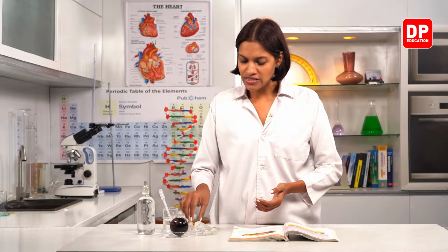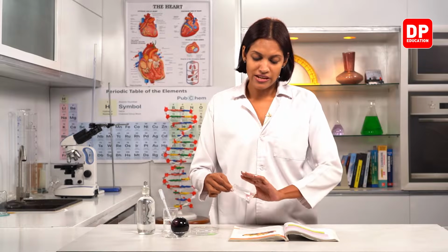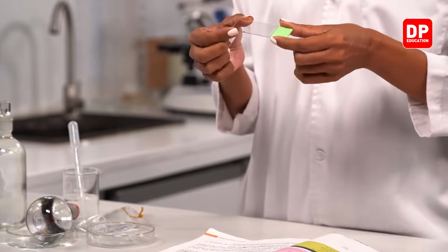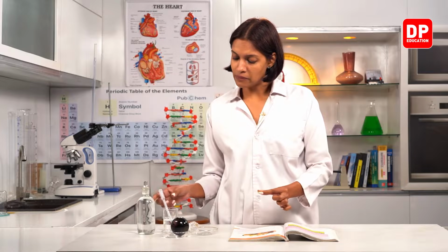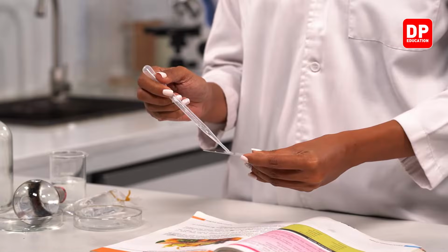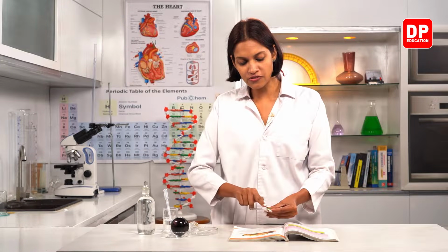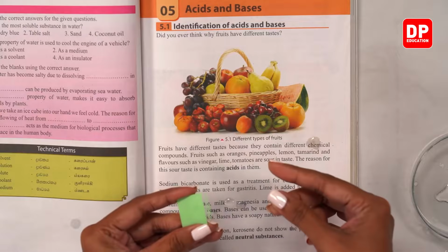And what can you tell about this bag? You all can see that is also round. Okay, that is also a curved shape, curved outwards. And when you consider the drop of water, what can you say, children? Even though we used only the glass slide, we could not see any difference in the letters. But when we place this drop of water, what happened? We could see bigger letters very well. Now look at the shape of the drop of water, children. Can you see? It is also curved, right? The surface of this drop of water is also curved. Right, children? Right.